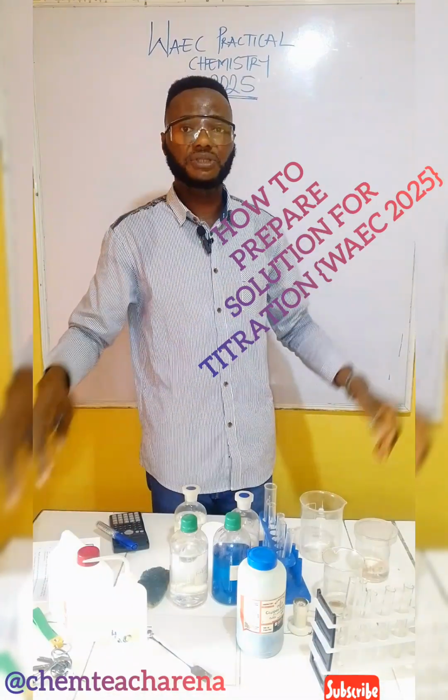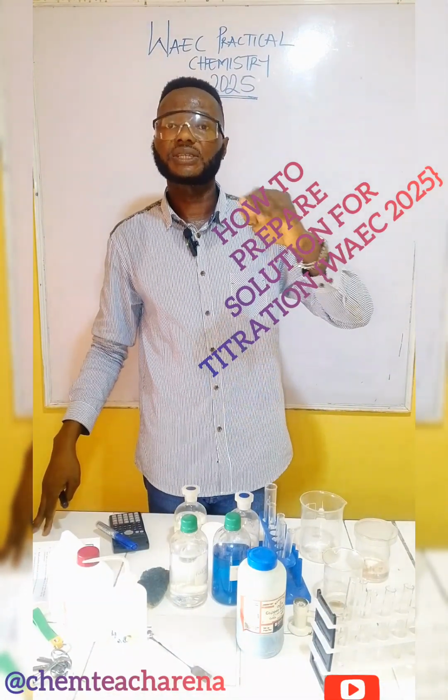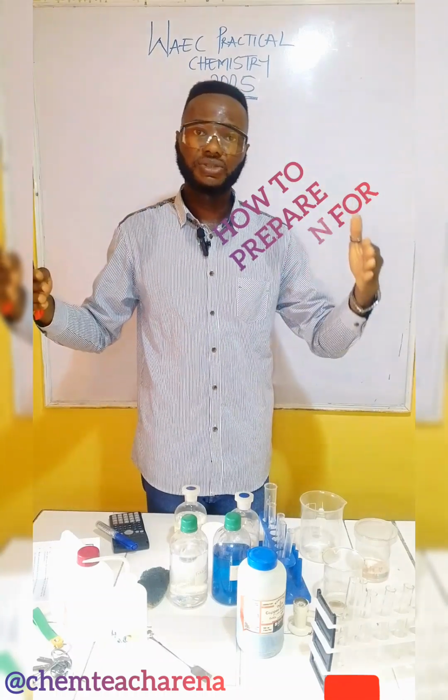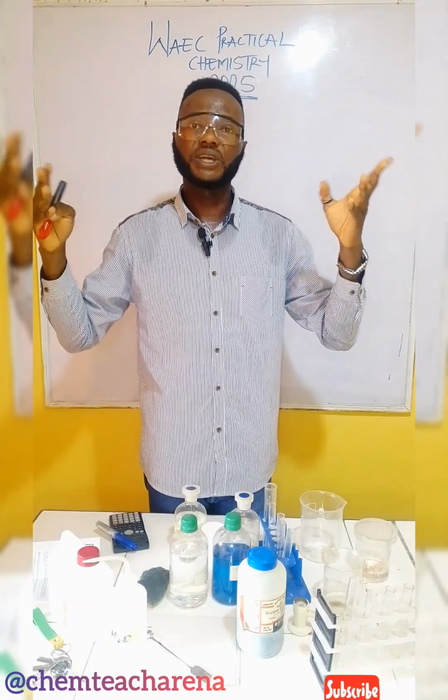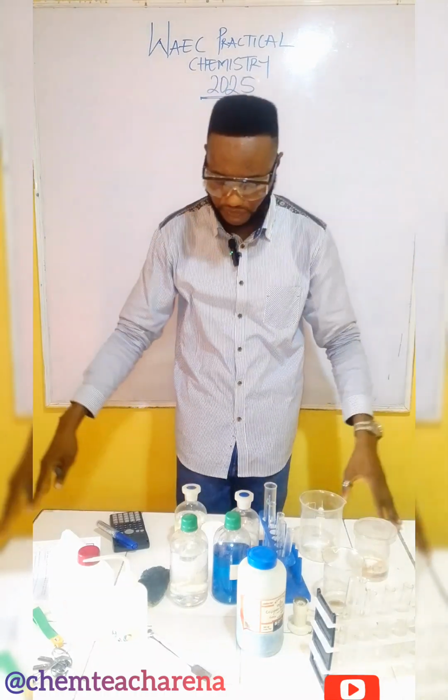That video is actually for teachers. That video that talks about the theoretical value, yes, it's actually for teachers. It will guide the teacher to know the range of endpoint he or she is to fall within. That is for that video.